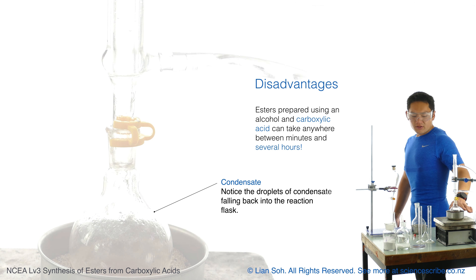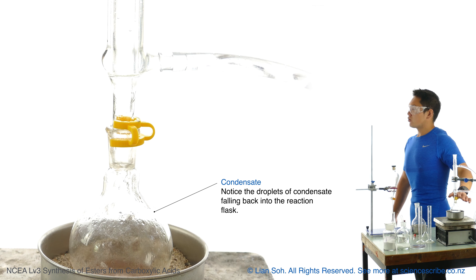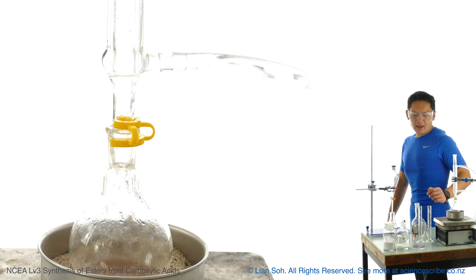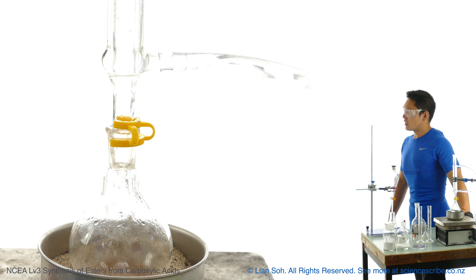Over here on top of the hot plate is the actual flask, which I've had running for about an hour to almost two hours now with gentle heat from the bottom. You can see there is a clear color change, so this reaction is pretty much done. I'm going to switch that off and collect the contents of the flask, which should be a mixture of our ester product and possibly some unreacted initial reactants.